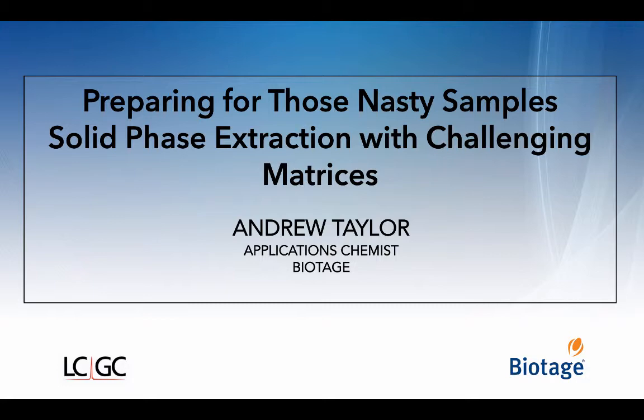Why do these samples have to be filtered before they can be extracted? There's a few different reasons that you need to filter the samples before SPE can take place. The first reason is to ensure that the entire sample is able to be processed through the disk. Many of the EPA methods require that a full 1 liter sample be extracted, so it's important that you're able to process through this full 1 liter. If you're dealing with samples that have high total suspended solid content, it's important that pre-filters be used to ensure that this whole sample can be processed through.